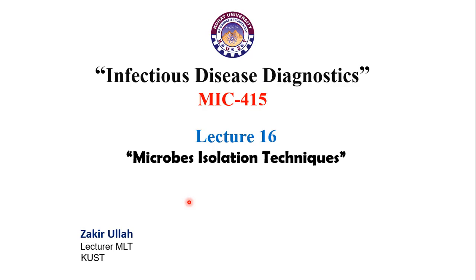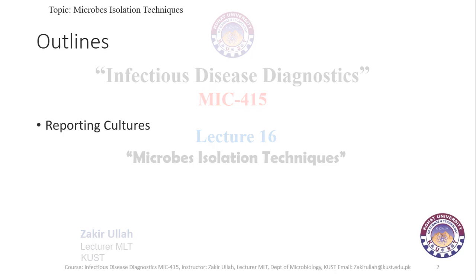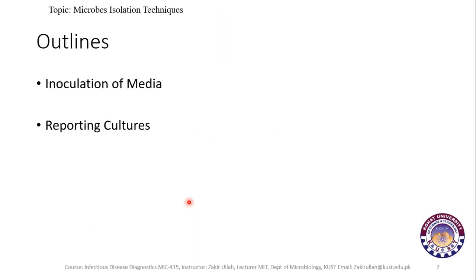Welcome to the next topic of infectious disease diagnostics. Today's topic is about the isolation of different microbes. In today's lecture we will learn about the different media which are used for the inoculation of microbes, and then the incubation of the media and microbes, and then the reporting of cultures.